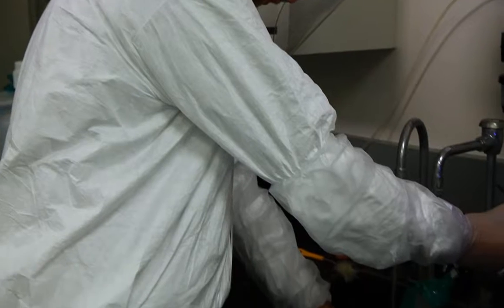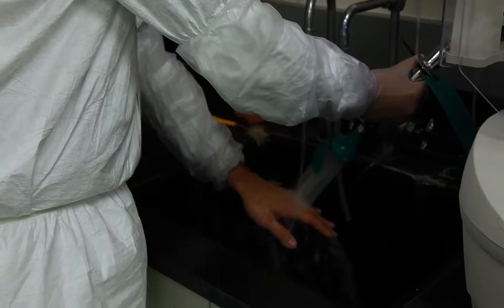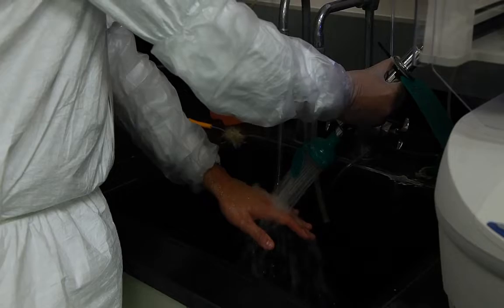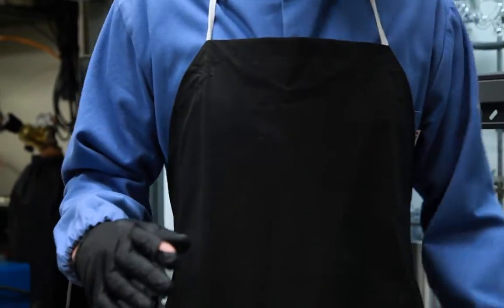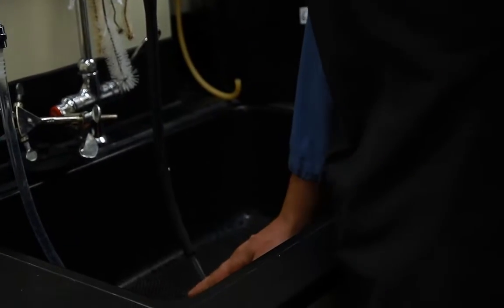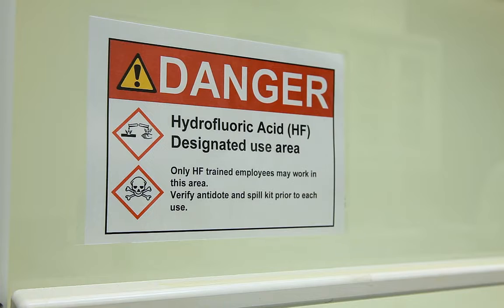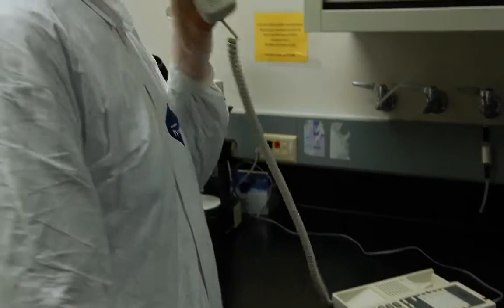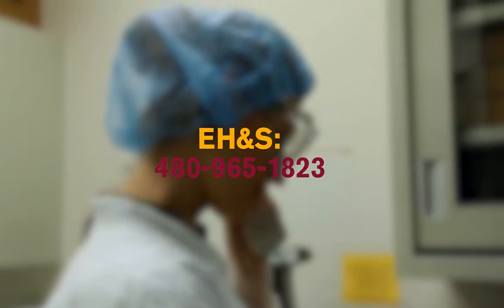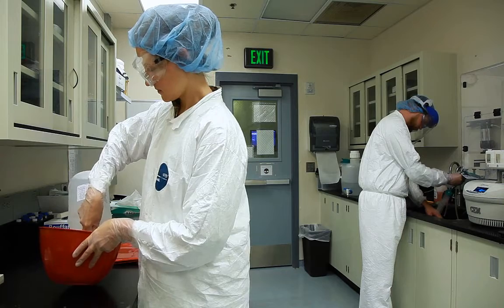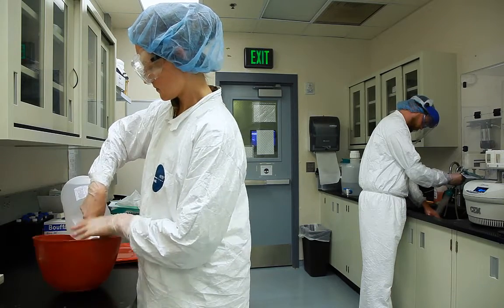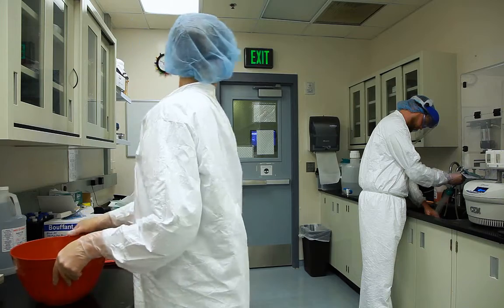In the event HF contacts your skin, remove all the contaminated clothing immediately within seconds. Flush affected area for five minutes. Followed immediately with the application of the antidote and immediate medical attention. Quick and correct action is critical if exposed to HF. Call 911. Call EH&S at 480-965-1823. Since you should not be working alone with HF without supervisor approval, a fellow researcher should follow this procedure.